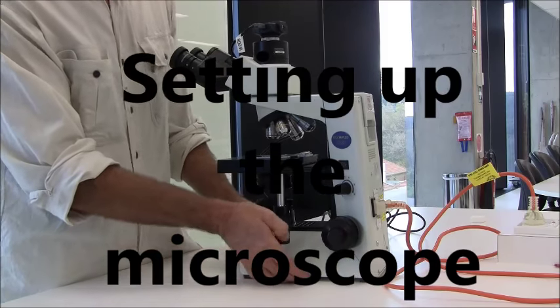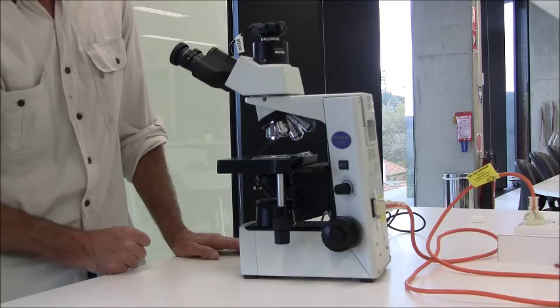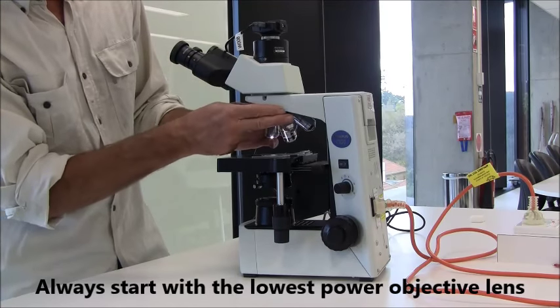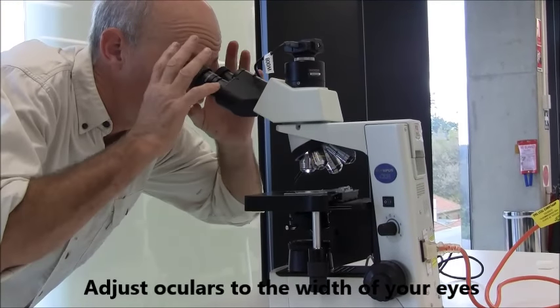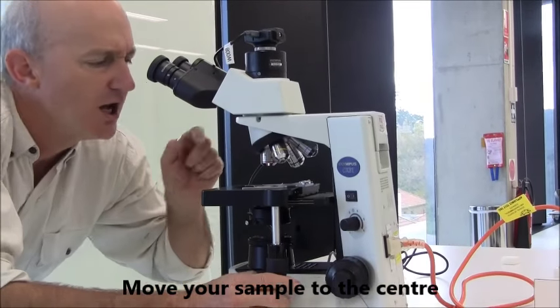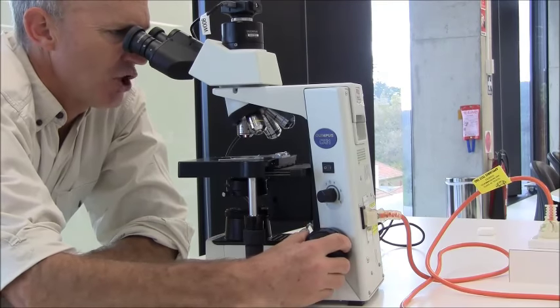Setting up the microscope is a little bit complex. The first thing you would do is plug it in and switch on the light — make sure you're getting some light coming out of the light source. Get your slide and clamp it onto the stage. Make sure you are using the low magnification objective lens clicked into place. Then adjust the distances between your two eyes so that when you're looking, it appears as one circle. Using the stage manipulating controls, get the sample into the center of the light source — I'm looking at where I expect the sample to be to position it in the center. Then, looking down the microscope, use the big knob to get it into focus.